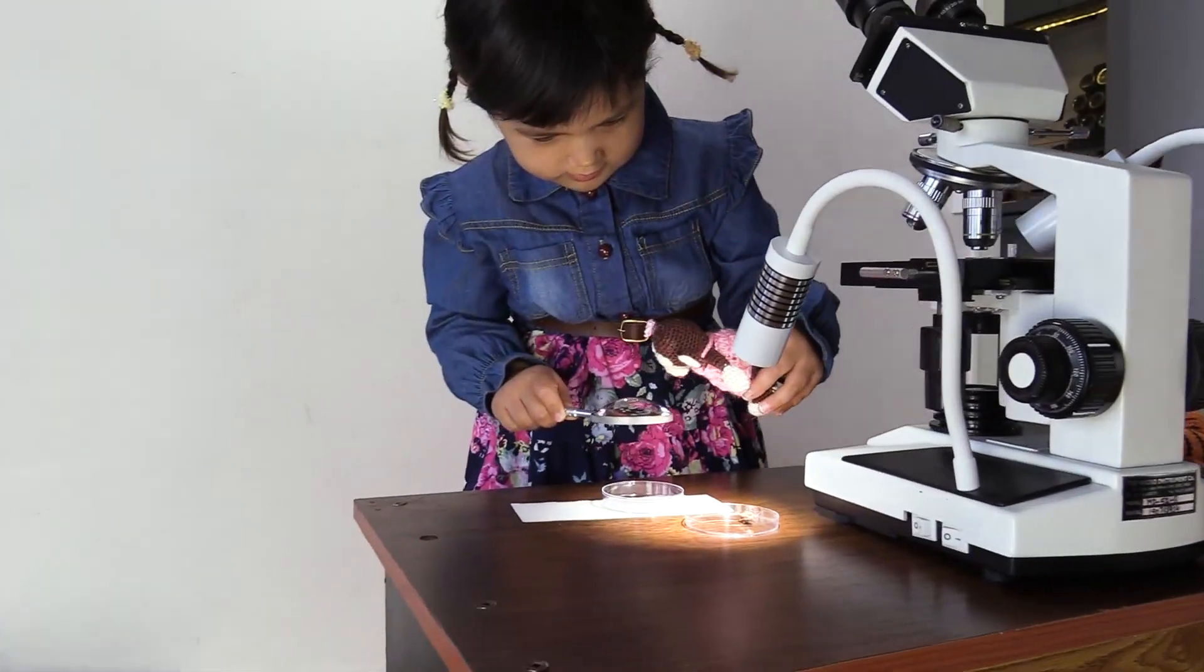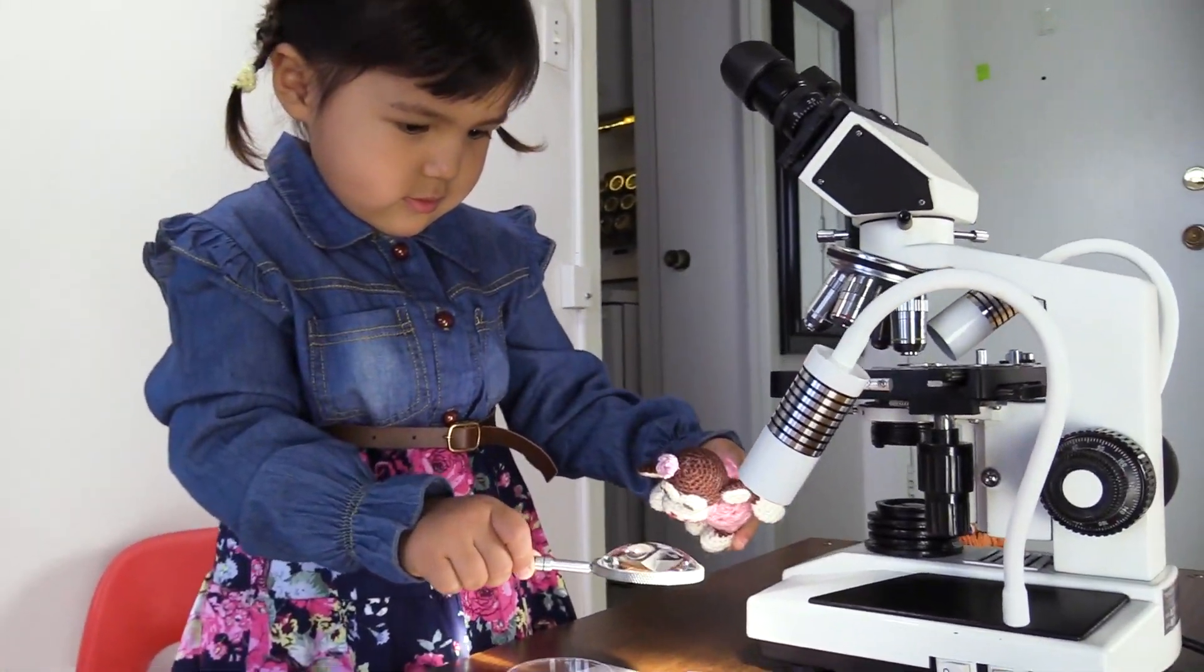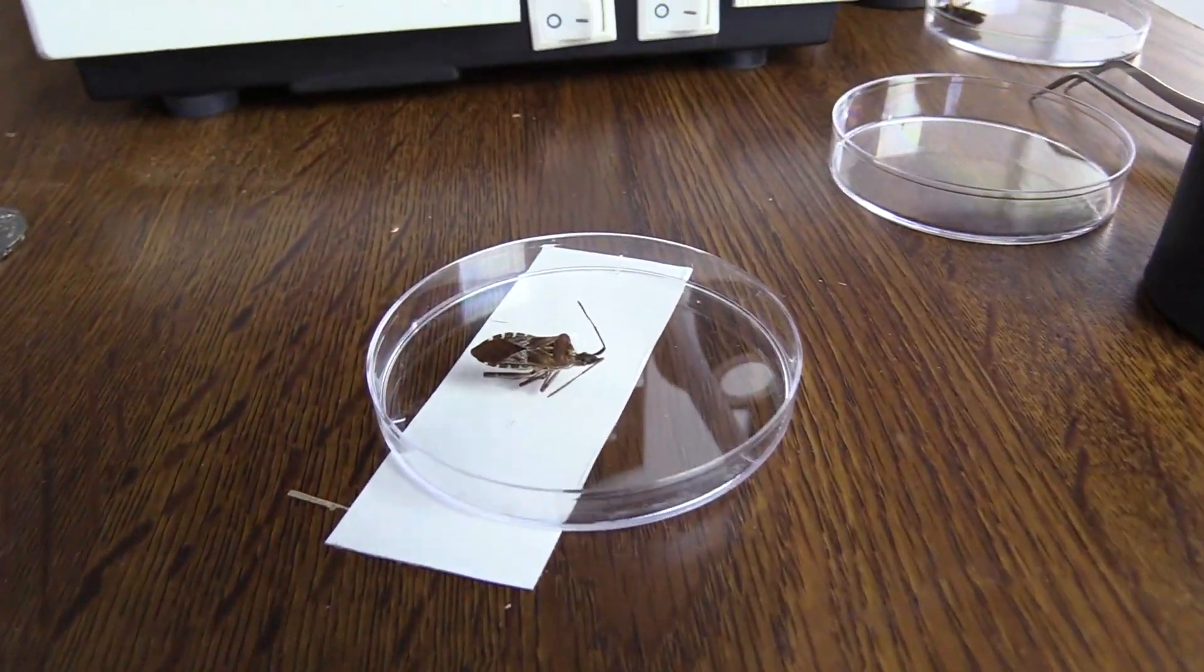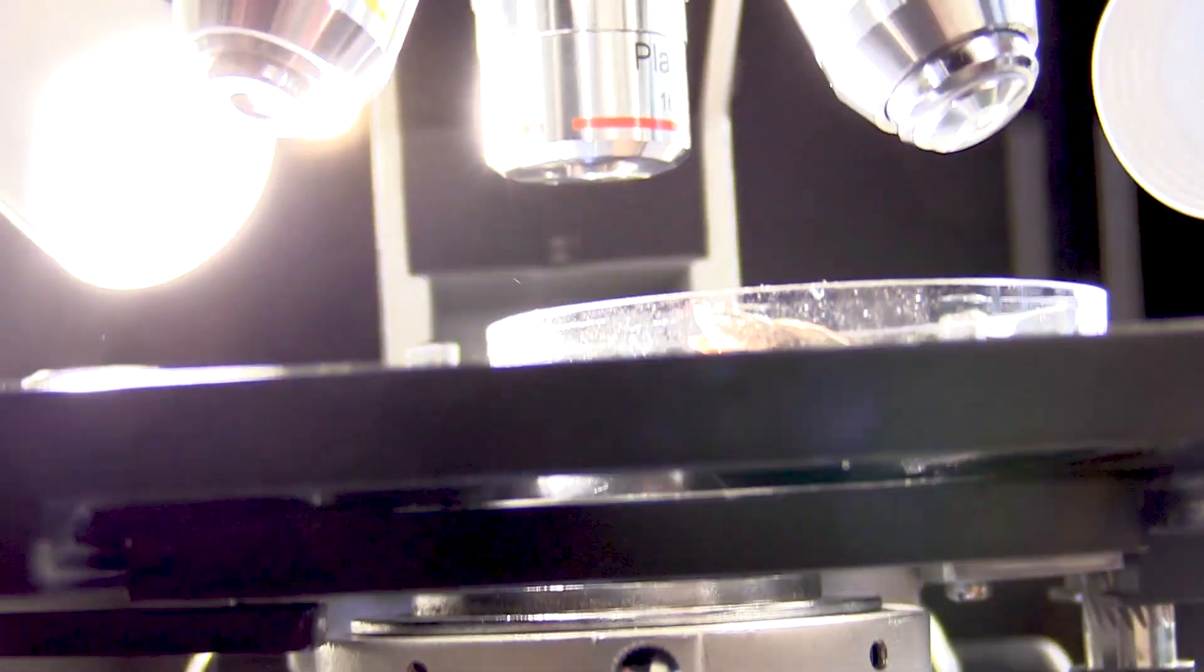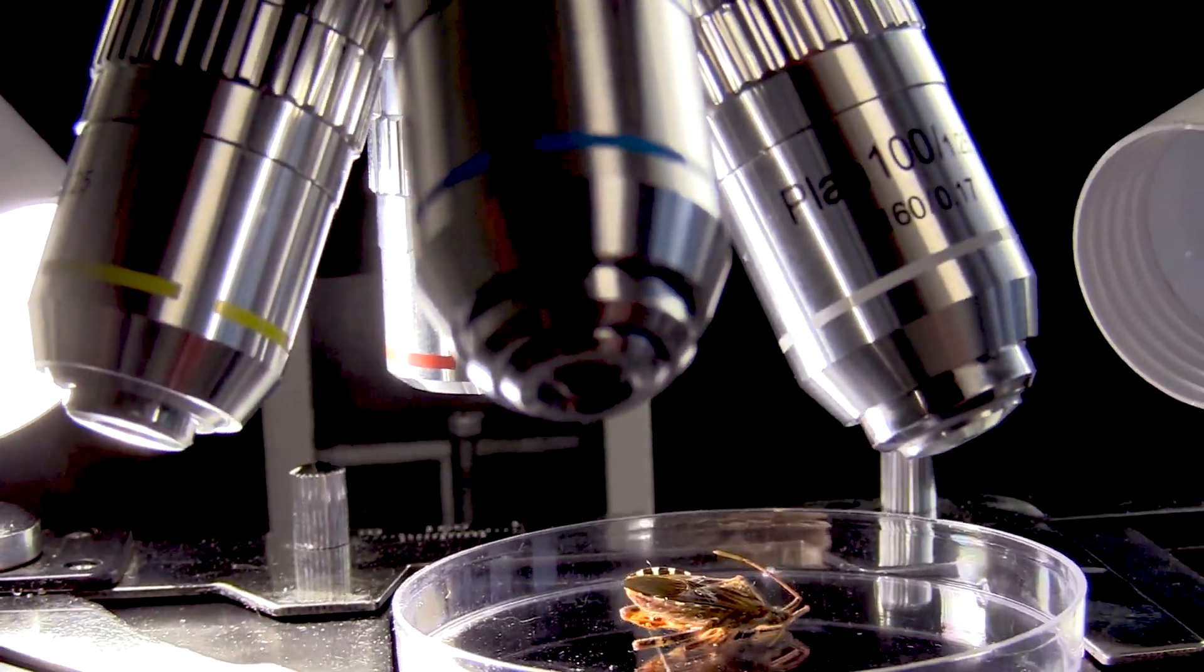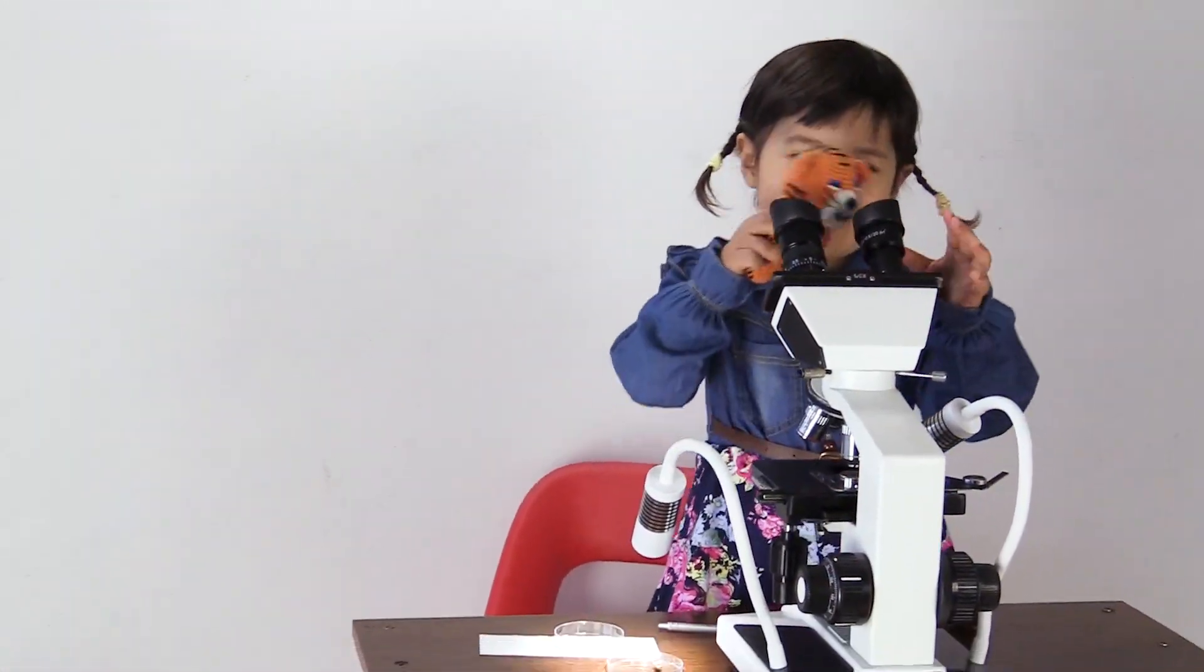However, if their parents are actively involved with their kids doing everything together, then working with a microscope will be a very good introduction to science in general.